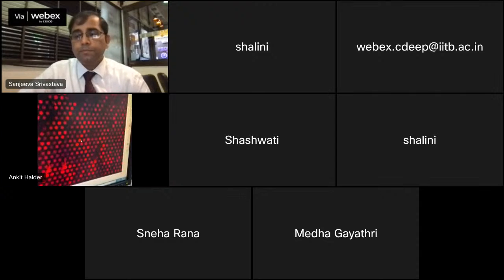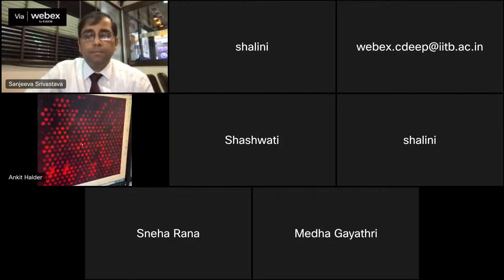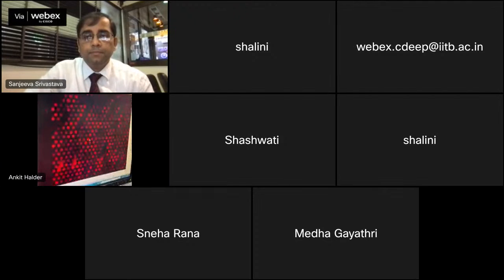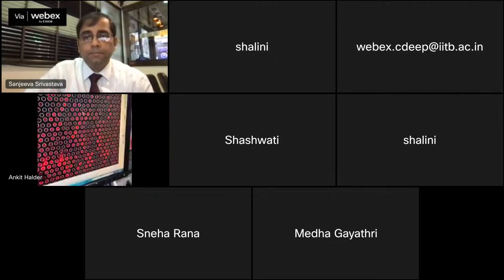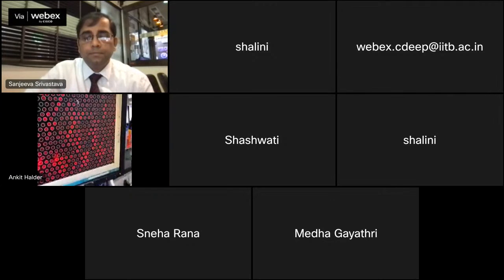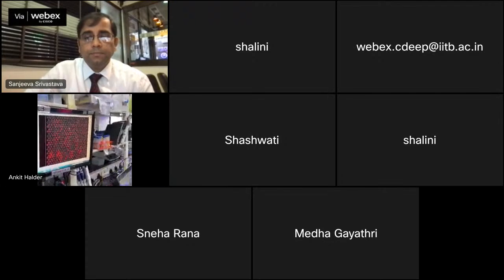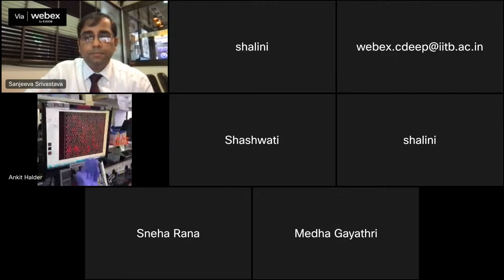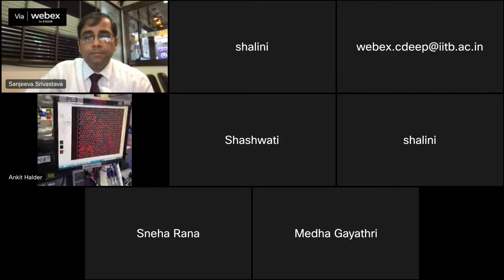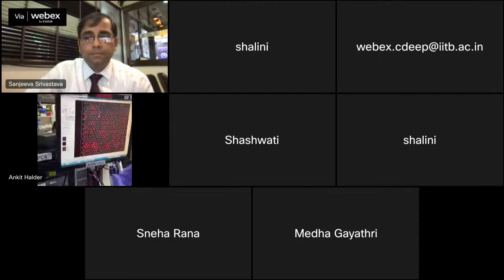But how do we extract the data? For that, one particular file, the GenePix Array List file, called the GAL file, is important to incorporate onto the spots to extract the data. Let me show you how the GAL file looks. This is a circular feature indicator. We usually call the spots features, and these grids are called feature indicators. We need to map them very carefully because we want to extract accurate data, so the grid placement is very important. It's manual work and takes a lot of time for data acquisition.